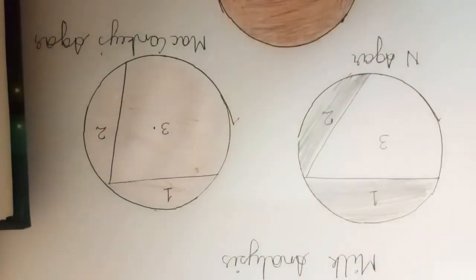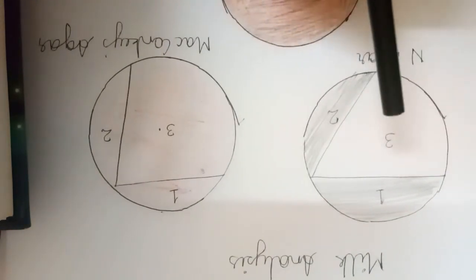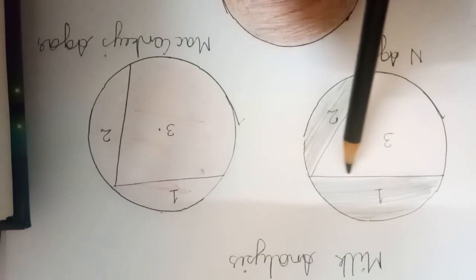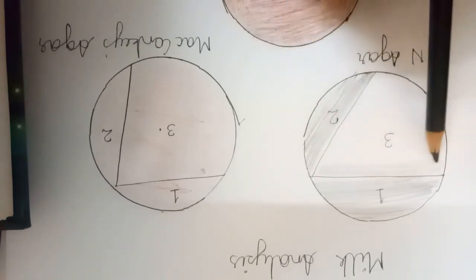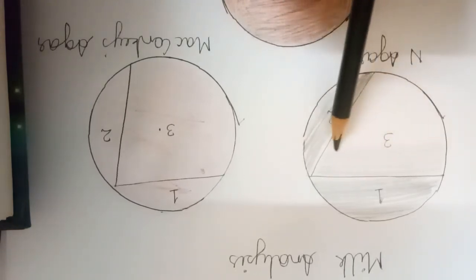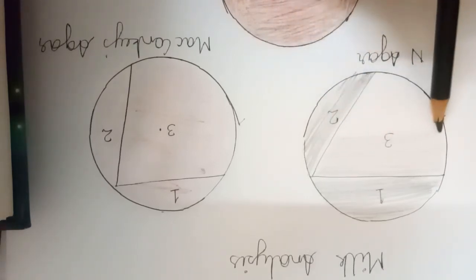Now we will go for inoculation of third sector. So that is to be done. Okay, very nicely. Now this is our nichrome wire, and we have started streaking the third sector. So by taking all precautions that it is not touching to the another sector, we are inoculating the plate. Okay, like this.